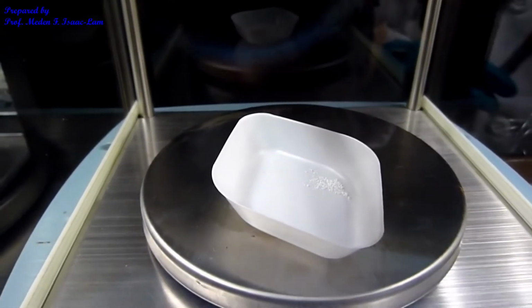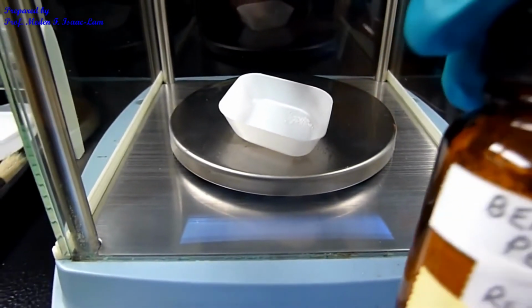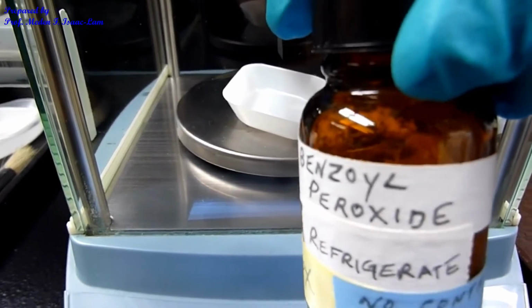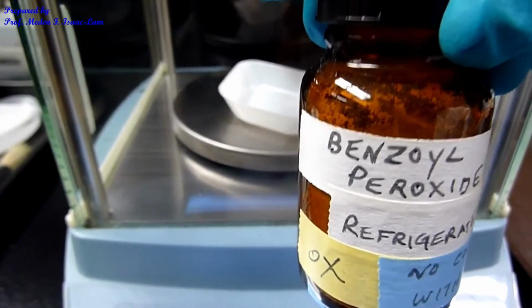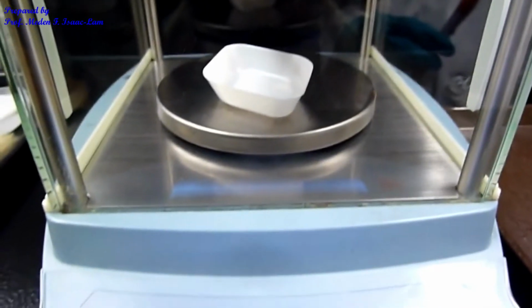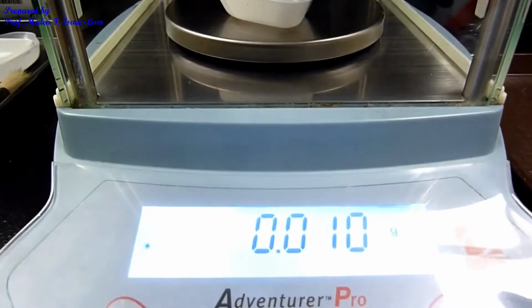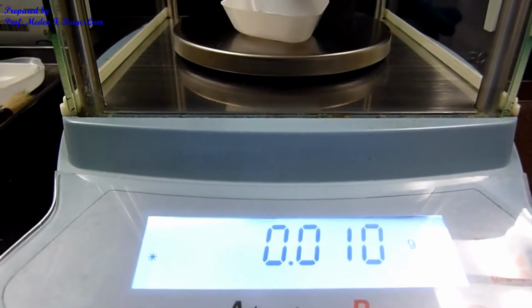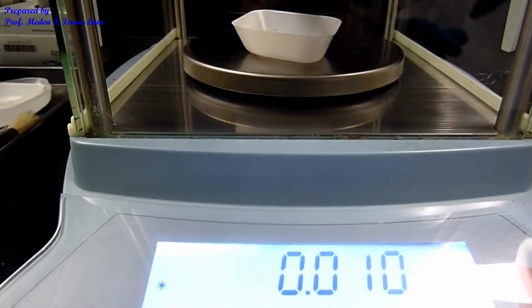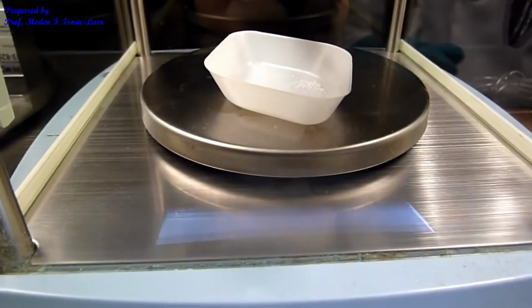The other reactant is the dibenzoyl peroxide. This is the container, and this is the initiator. I already weighed 0.010 grams, or 10 milligrams, of the reagent. And it's actually a very small quantity. It's a very small amount.